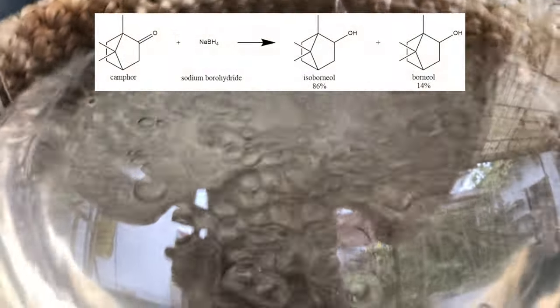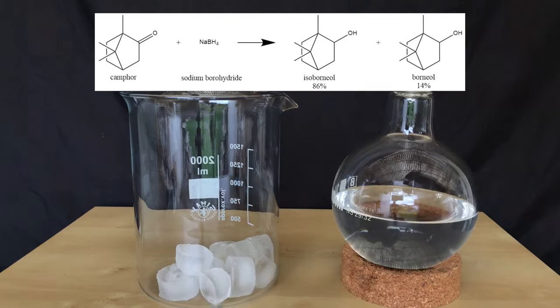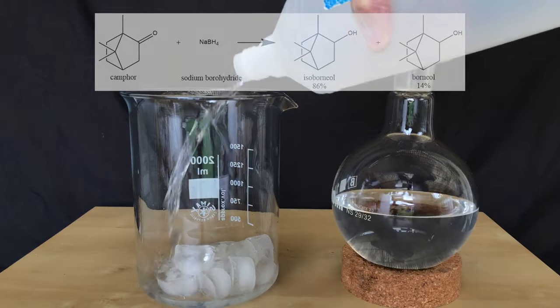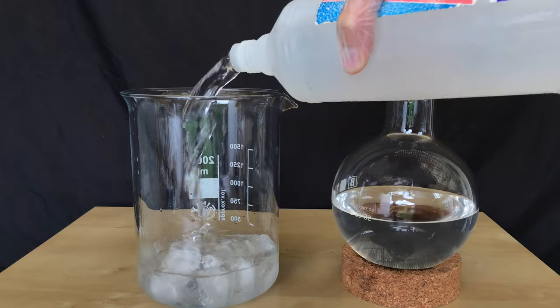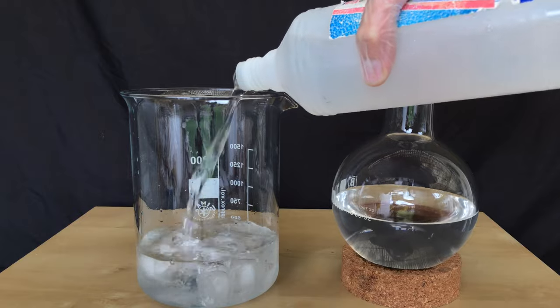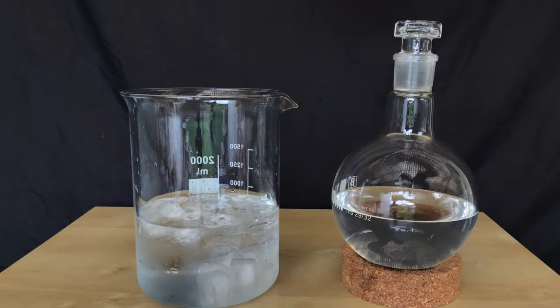The camphor is reduced by the sodium borohydride to mainly form isoborneol and also some borneol. Once the reaction was finished we needed to find a quick way to get the product out of the methanolic solution. A method that combines isolation and purification is to simply add the methanolic solution to ice water.